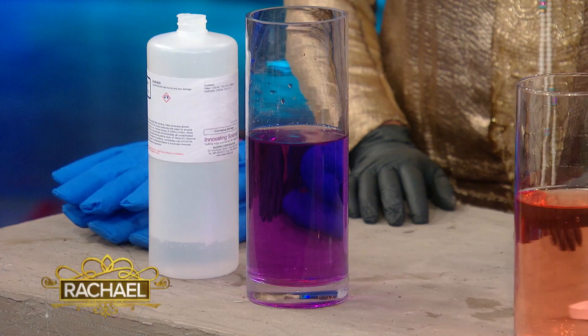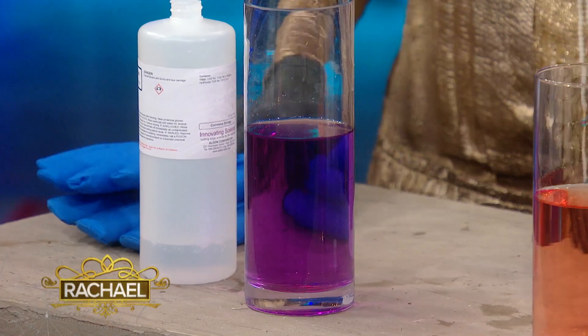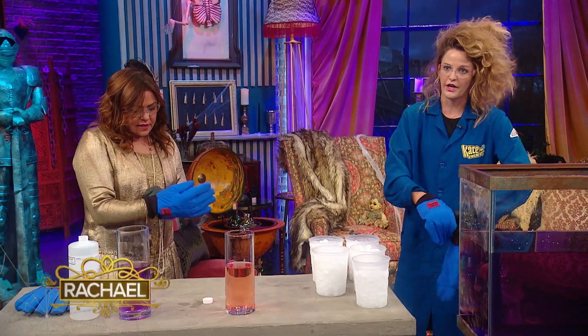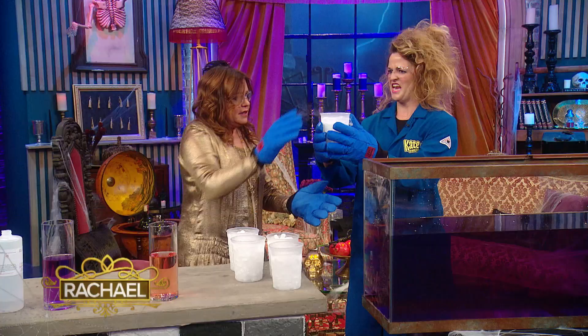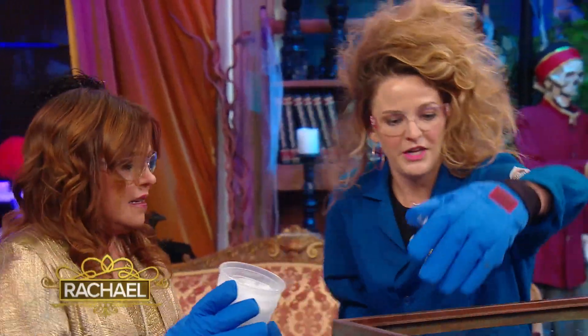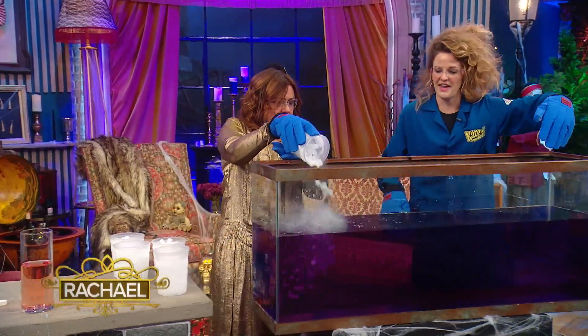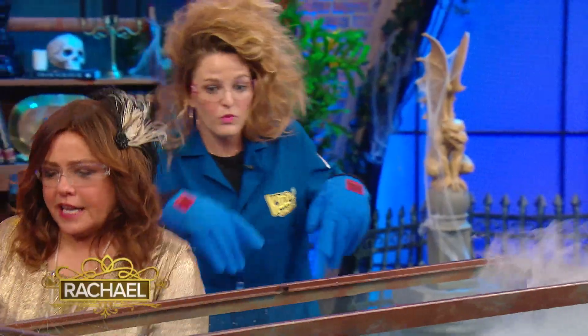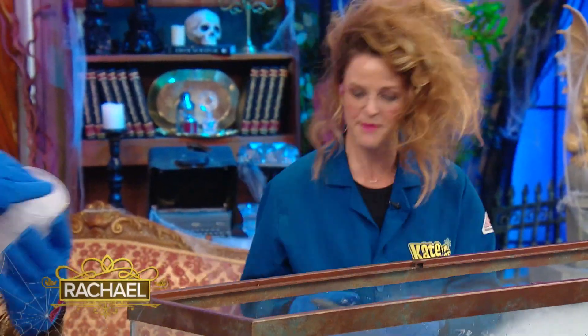To see how we actually get here, come over here, grab your gloves. These are our cryo gloves, so these are gonna protect us against a cryogenic, which would be dry ice. Dry ice is really, really cold, so never touch it with your bare hand at home. Grab this container that has dry ice and dump it in here — this is sodium hydroxide in there. All the way along, beautiful. Keep adding, keep adding.